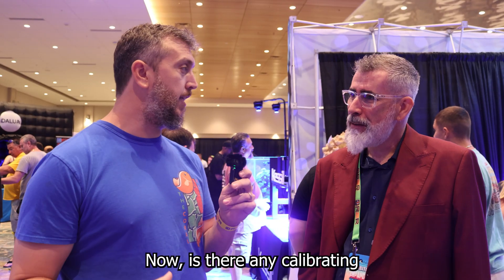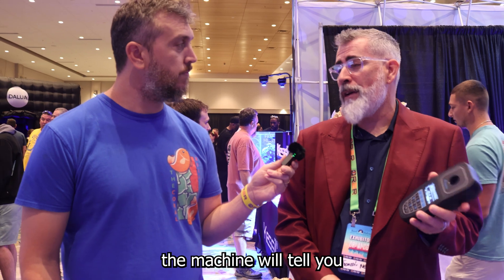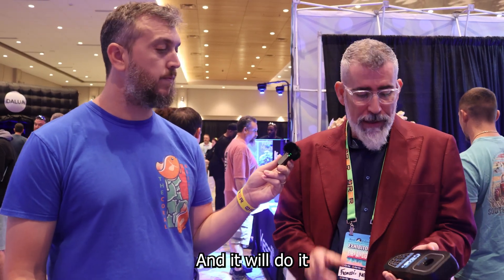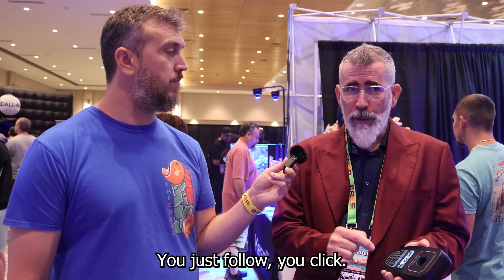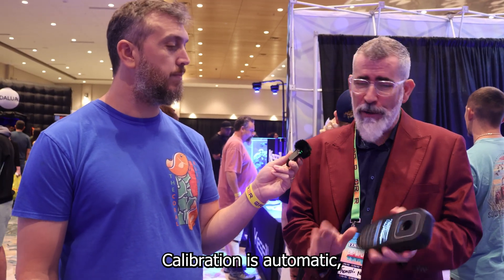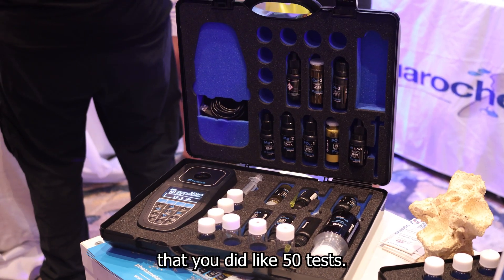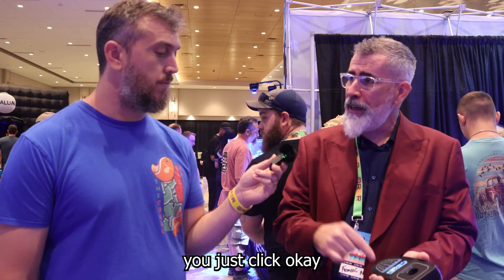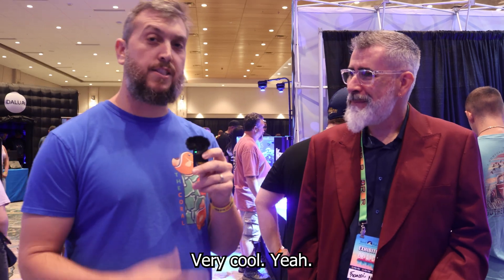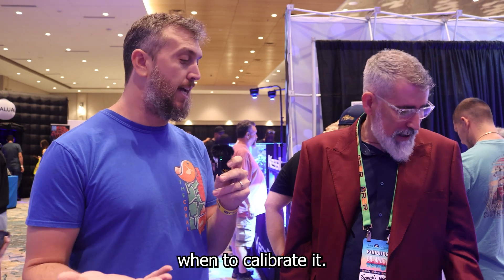Does the meter need calibrating after a while? Yes, you need to do calibration, but the fun fact is the machine will tell you when to do it, and it takes as little as two minutes. You just click OK and follow the guide — calibration is automatic. The machine will say you've done 50 tests, now it's time to calibrate, and you just click OK and follow the steps. Very easy.